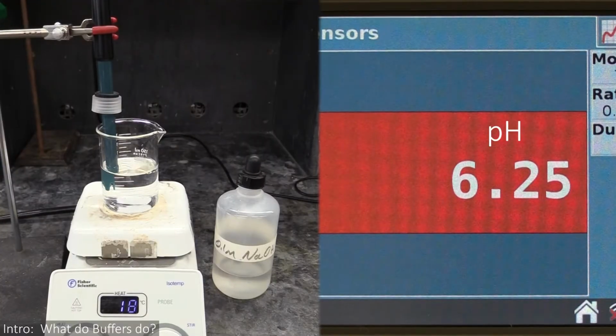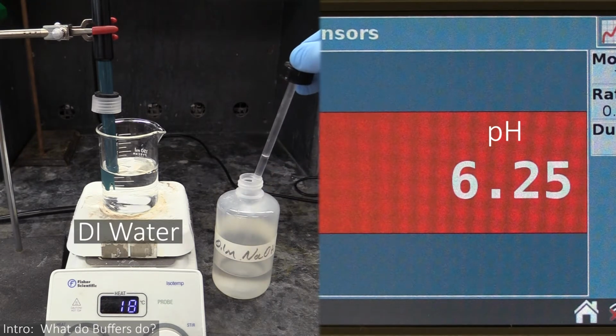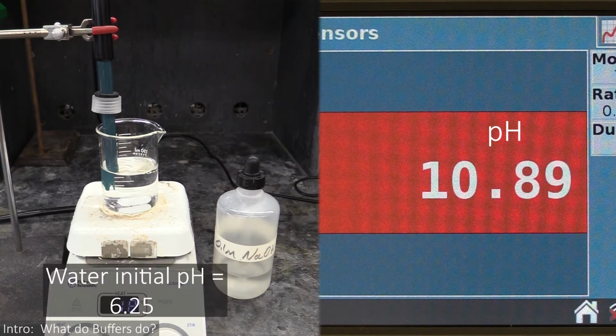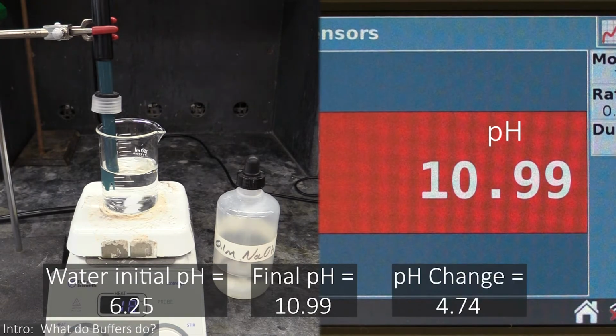Next question, what do buffers do? The answer is in the name. They buffer solutions against pH changes. To show you what I mean, let's take some DI water and see what happens when we add sodium hydroxide to it. The water starts out at pH 6.25 and rises to pH 10.99 after the base goes in, for a pH change of 4.74 units.